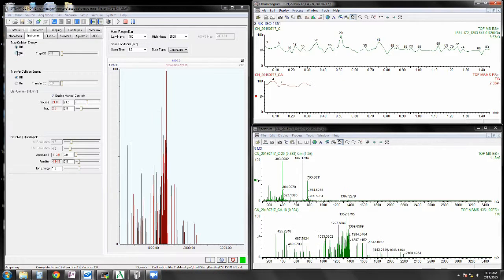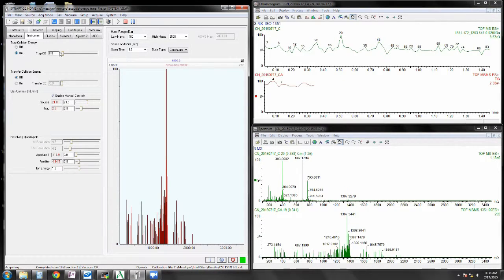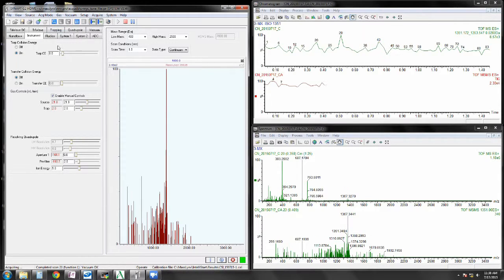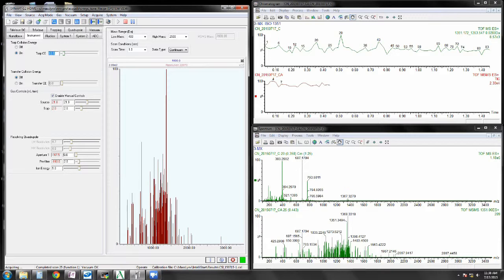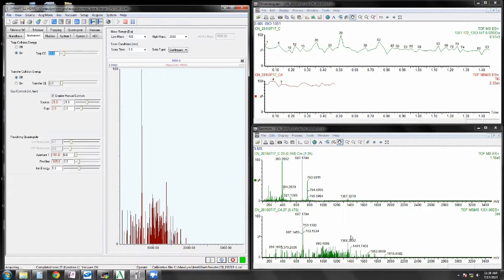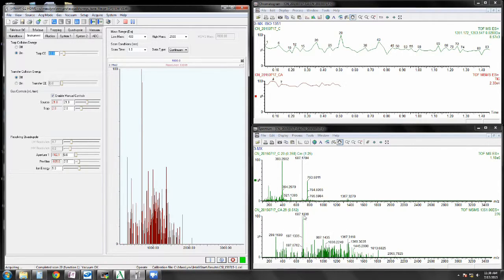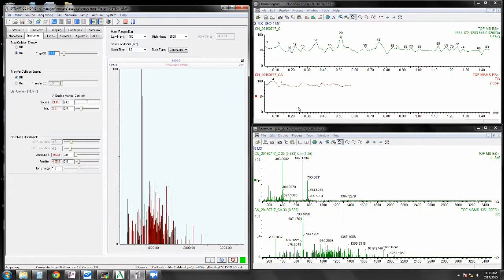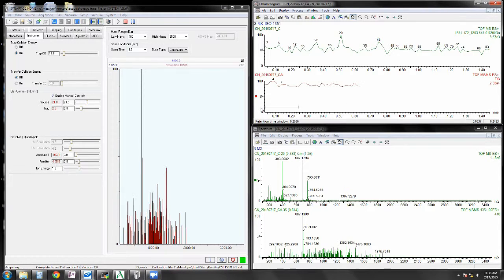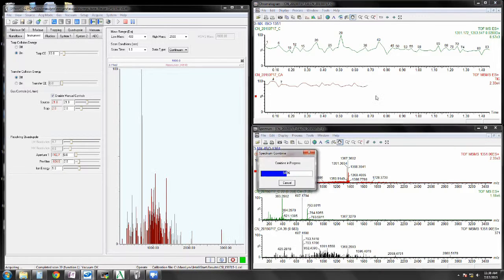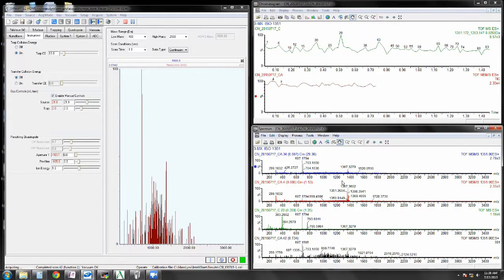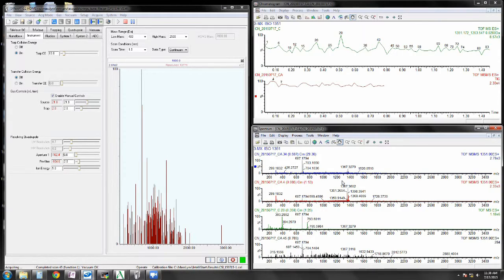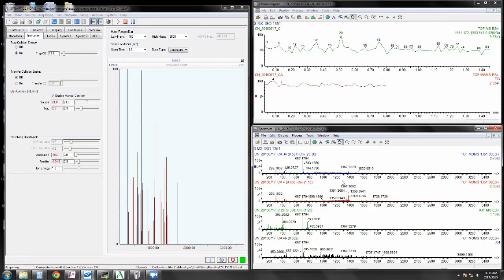To cause fragmentation down from the octamer down to the tetramer. I've increased the energy here. The octamer drops off and the tetramer begins to appear much stronger. We could sum up over different areas of the spectra to compare pre-fragmentation with post-fragmentation. This can be done on proteins to sequence or identify the localization of additions or modifications.